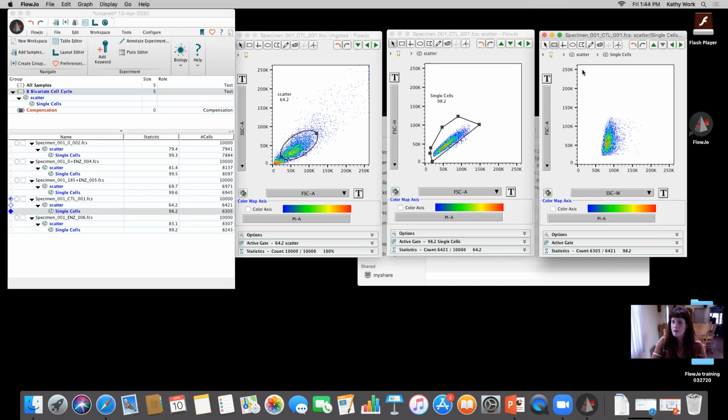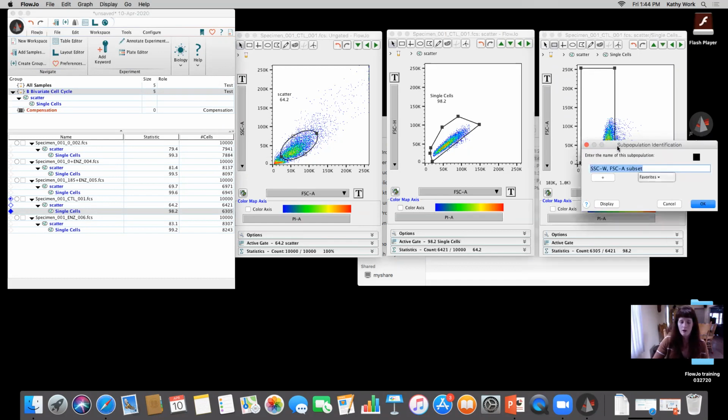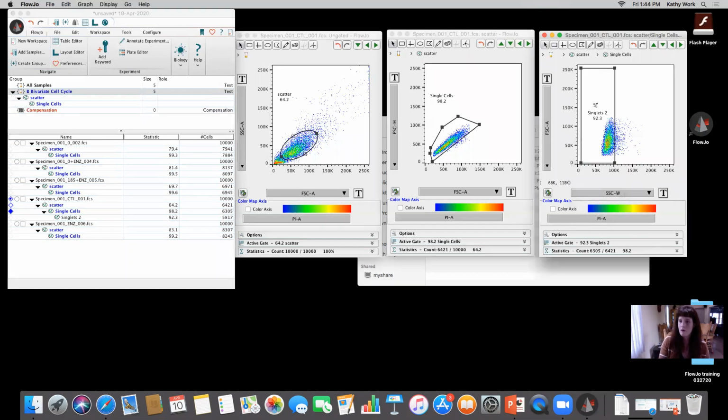So the BrdU is a nucleoside that we'd put into the cells and let them incubate, and then after we do the viability and we do surface staining, whatever's necessary, we can come in with an anti-BrdU antibody tagged to a fluorochrome to be able to pull out cells in S phase. So that's what we're going to see here.